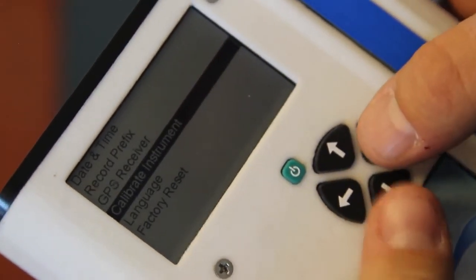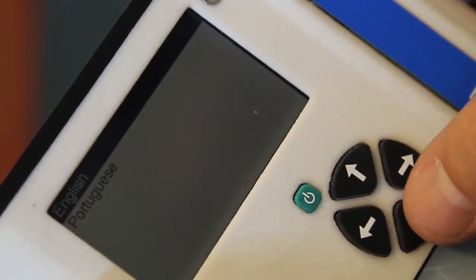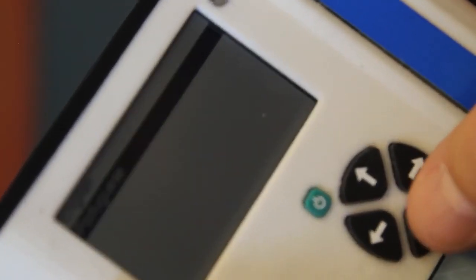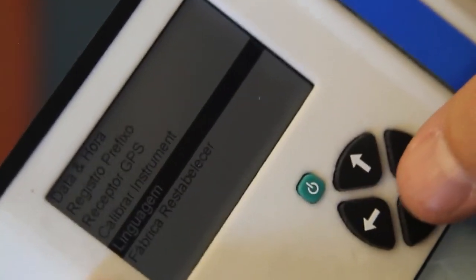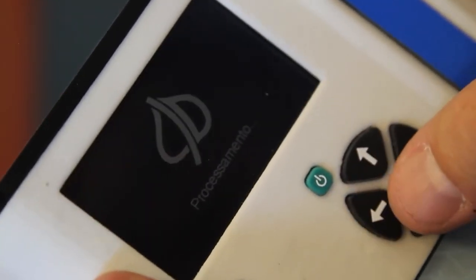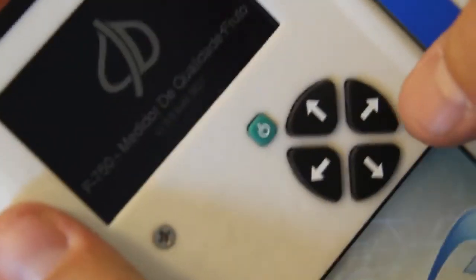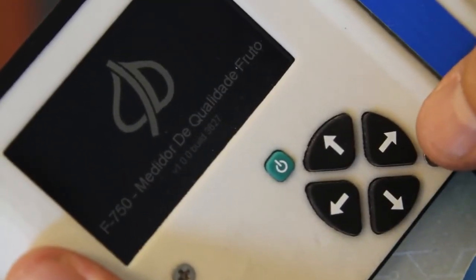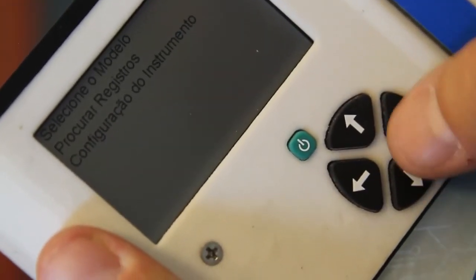We also have the ability to change the language on the device. Currently it's set to English. Scrolling to Portuguese, and suddenly we're using the instrument in a different language.